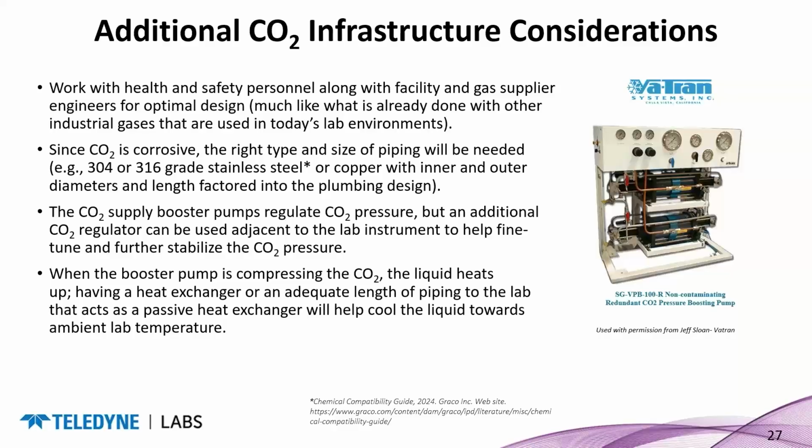So a system like this one shown to the right, a VATRAN system, is used to pull the gas off the top of a CO2 dewar, recompress and bring it in, or there's liquid pumping type booster pumps as well available on the market.